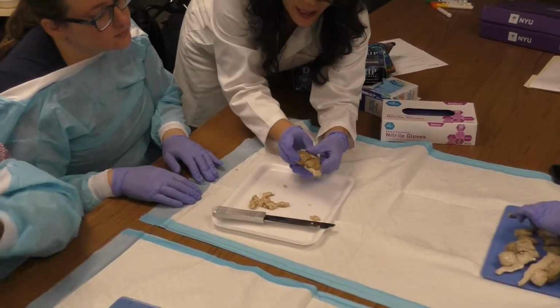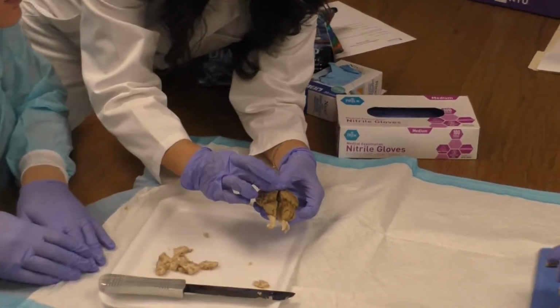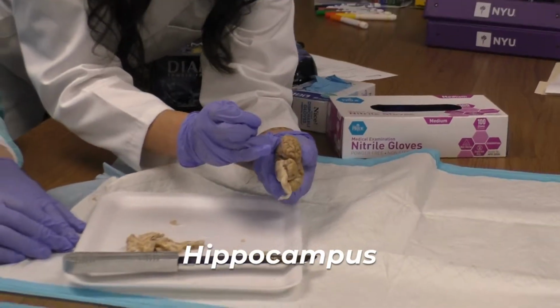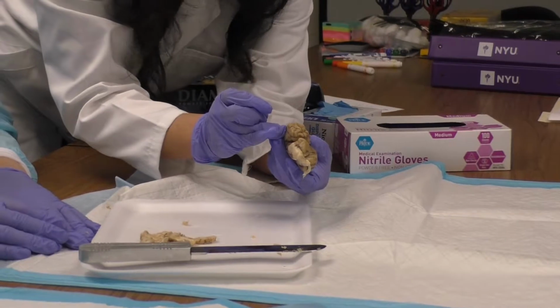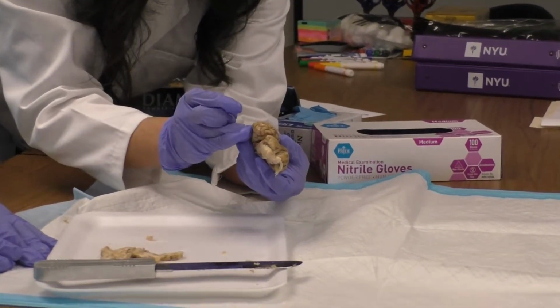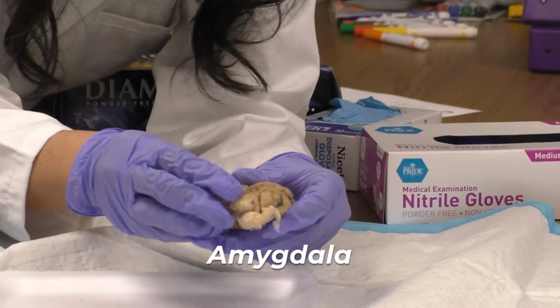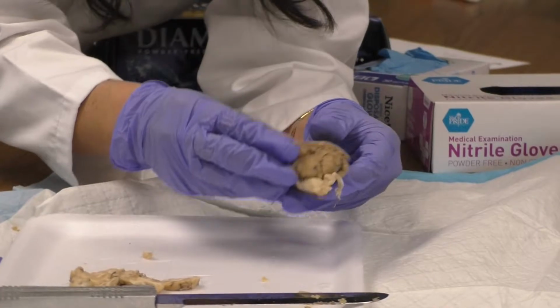Okay, so the hippocampus is a C-shaped structure that goes right about here below the cortex and goes down into the front of the temporal lobe. And sitting right in front of the hippocampus is, what other structure? What's right in front of the hippocampus? The amygdala. The amygdala, yes. I thought the amygdala was behind it. No, amygdala is in front of the ventral part of the hippocampus.